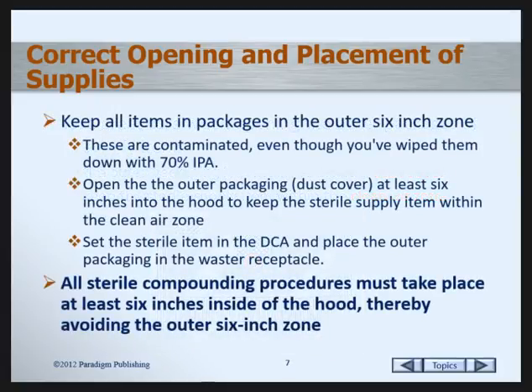Keep all items in packages. All sterile compounding procedures must take place at least 6 inches inside the hood, thereby avoiding the outer 6-inch zone.